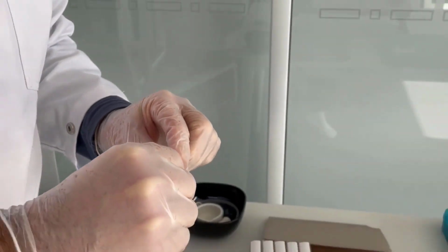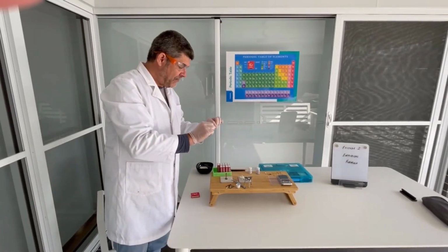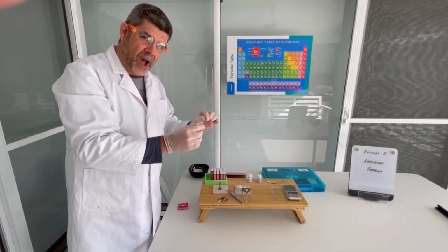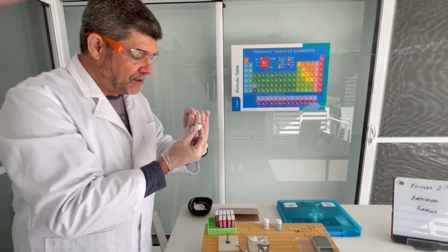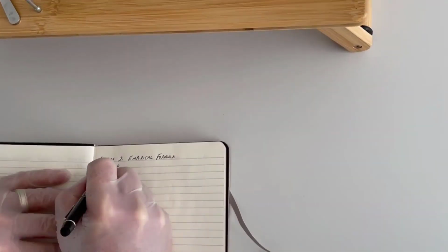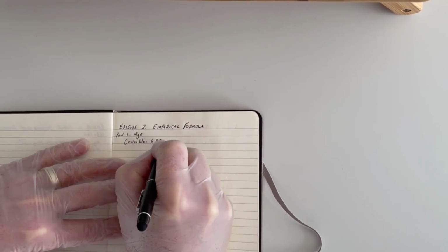This time though, I want to try and recover all of that magnesium oxide. So to do that, I want to weigh it, but I don't want to hold it. I'd like to actually contain it within a crucible. So this is a crucible, and I want to weigh my crucible. So my crucible weighs 6.87 grams.